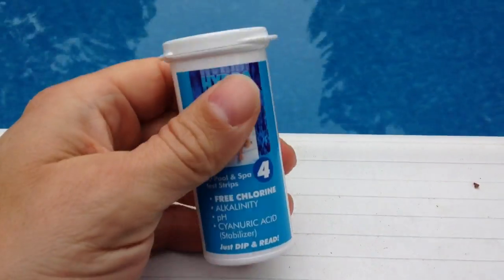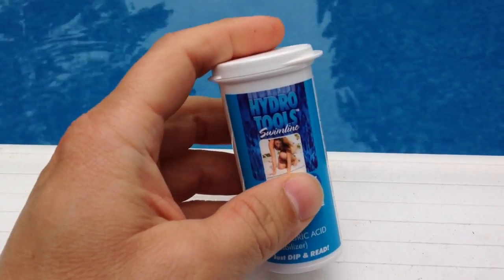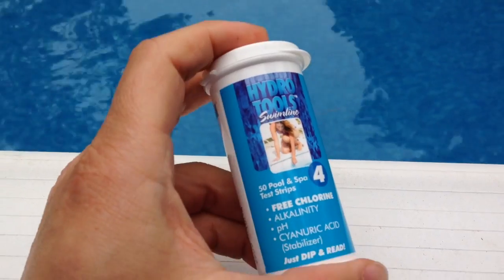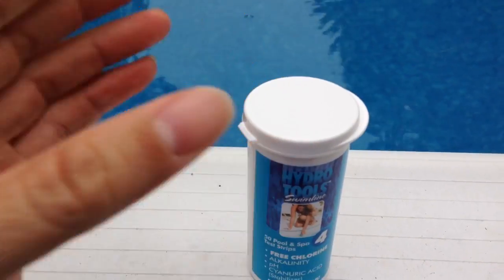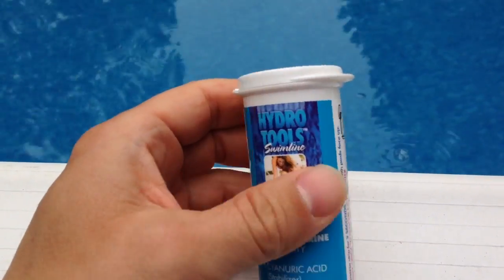I want to show you how to use these test strips to test the pool water in your pool. I do have another video on how to use the liquid ones. I'm kind of an old school guy and the pool store ran out of the liquid test drops, so I picked up these strips and they're not too bad — they're pretty easy to use.